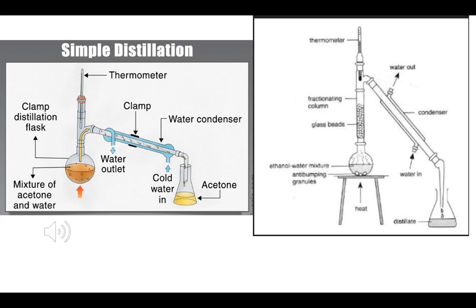The disadvantage of simple distillation is that it takes a long time, and you have to do multiple simple distillations to get a pure compound. If you have a ratio of 27:1, that usually means you have a 96% pure compound. But fractional distillation is basically doing multiple distillations at one time. It increases purity but reduces the yield.